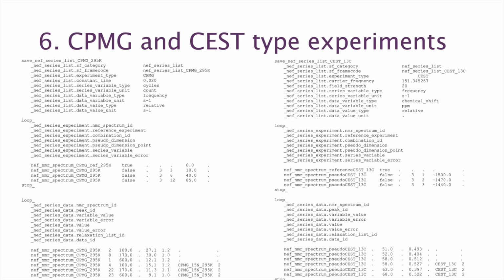As I have already indicated in a number of places, we've tried to make sure we cater to CPMG and CEST type experiments in everything we have proposed. I won't say anything more here, but there are a few more comments on this in the full proposal document on GitHub.